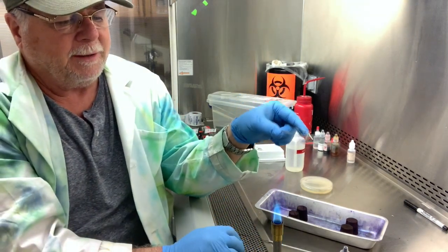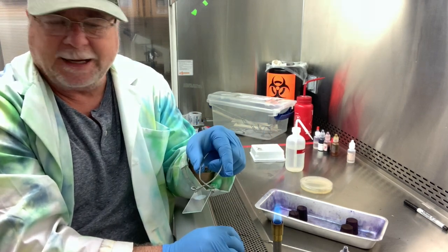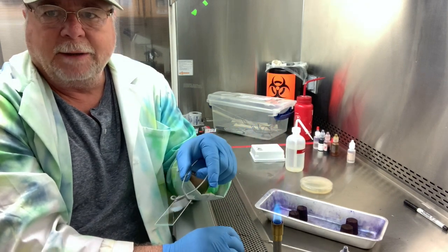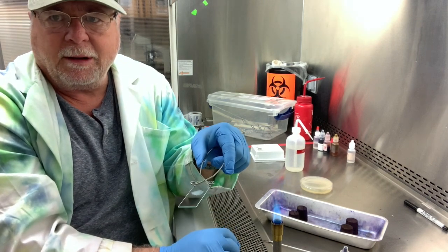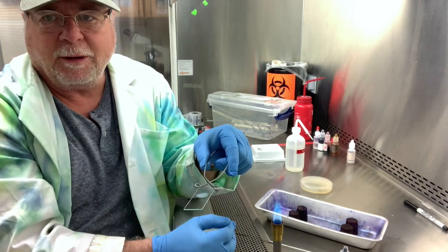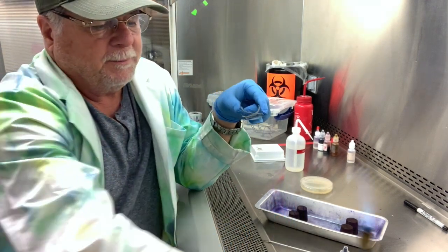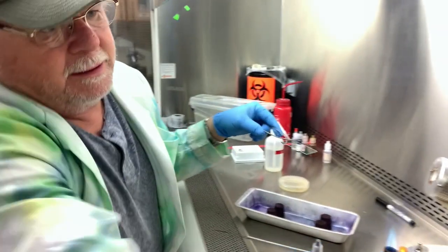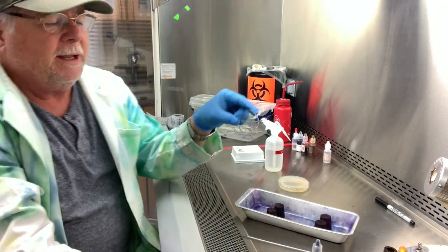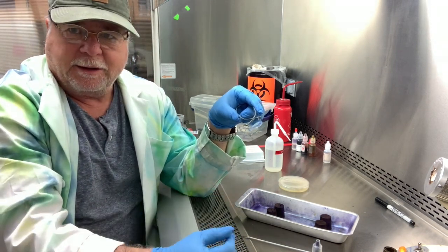Okay, and I'm going to pass it through and just pause briefly. A split second. So once, pause, twice, pause. If you're holding over that burner very long, more than a second, then it's likely that it's going to crack the glass and you have to start all over. Plus you have to deal with the contamination sometimes. All right, so I've now fixed it. And so this is now a heat fixed smear. Okay, so we smeared it first, and then we heat fixed it.